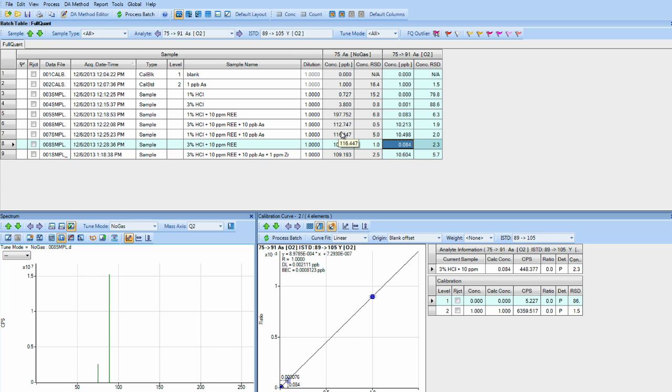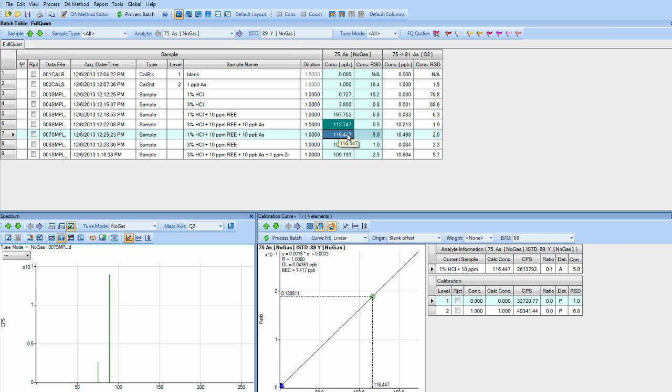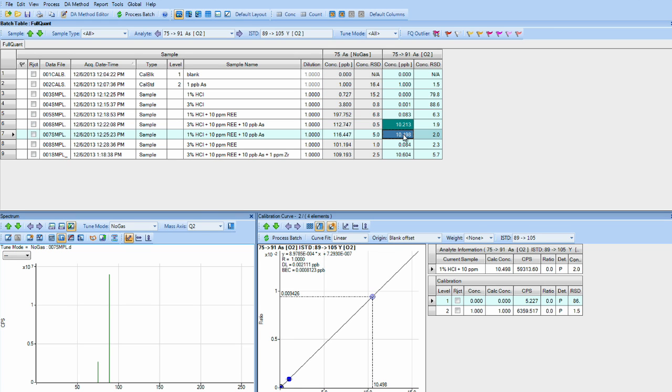Next, we've spiked the sample with 10 PPB arsenic. In the 75 no gas modes, we don't see a real good correlation because of the interference that's being created by neodymium and samarium. In the 75 to 91 oxygen mass shift mode, we get great correlation with 10 PPB recovery on both samples.